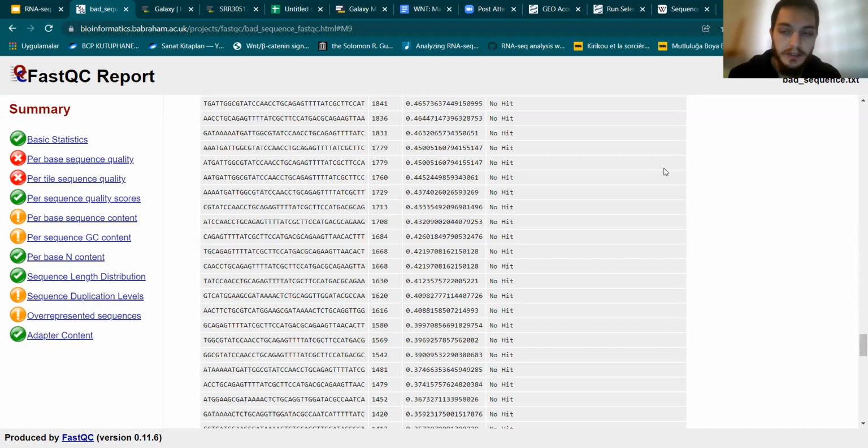There is documentation for this page that goes over every one of these summary sections, and that also explains what may be the cause of it. For the per base sequence quality, for instance, it says if there might be a bubble in the sequencing, or in the per sequence GC content, there might be a contamination by other organisms, that kind of thing, or the library preparation. There's a very nice document for it in this site. So you don't need explanation. That was offering the explanation.